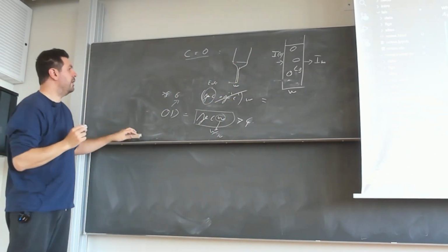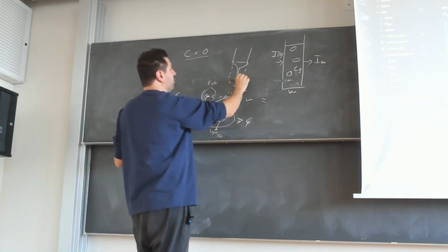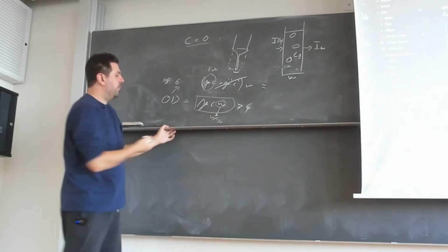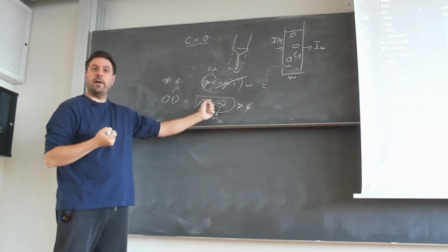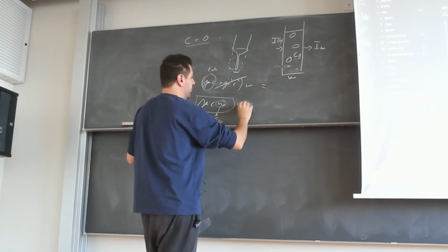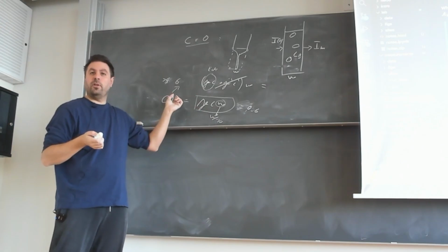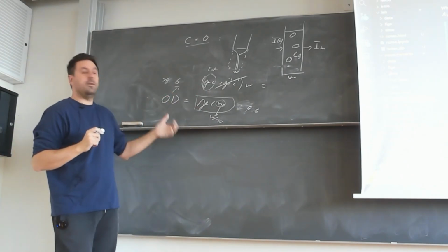That has one tenth the width. It will perhaps have something like this to be inserted in the same device, but in principle, the liquid can be only in a small slice here. So we are dividing W by 10. And if you do that, your OD, according to our formula here, will be divided by 10. So suddenly, we will get something like, for example, 0.6. And if we retransform this to the classical OD, we will have actually 6.